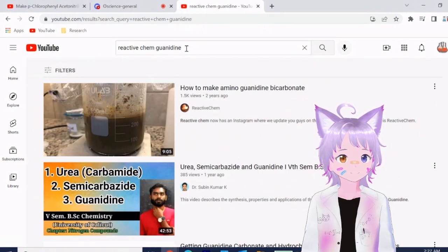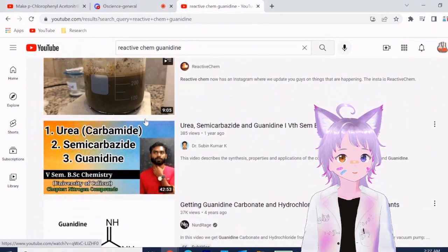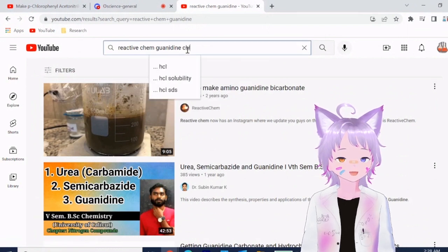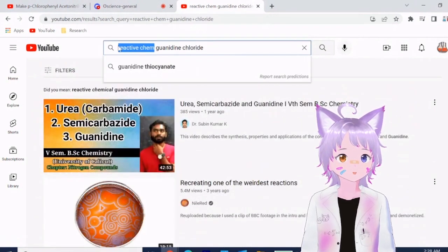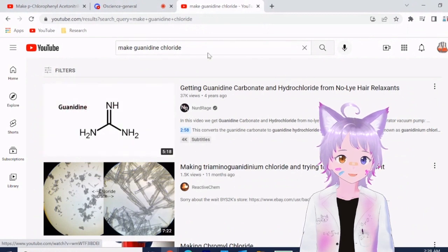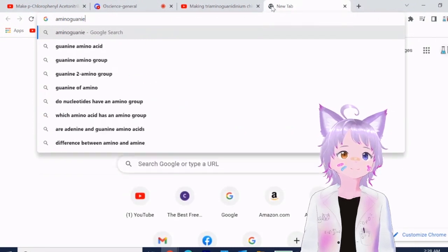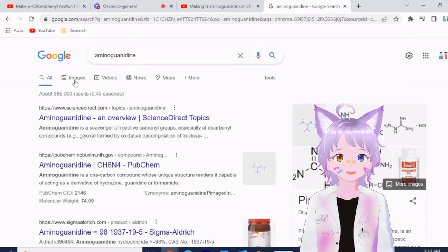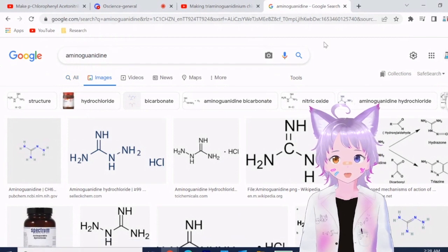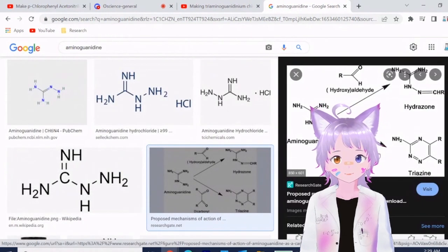Yeah, that was aminoguanidine, but he also made something else. Like, he also made guanidine chloride. Really? Someone made guanidine chloride. I think it was someone else. I think that was NurdRage. Hydrochloride. No. There it is, triaminoguanidine chloride. Can we convert it? Okay. No, we have an amine. I don't think... No, we cannot. Because guanidine is... is there a way, though, that we can make something else? Is there a way?